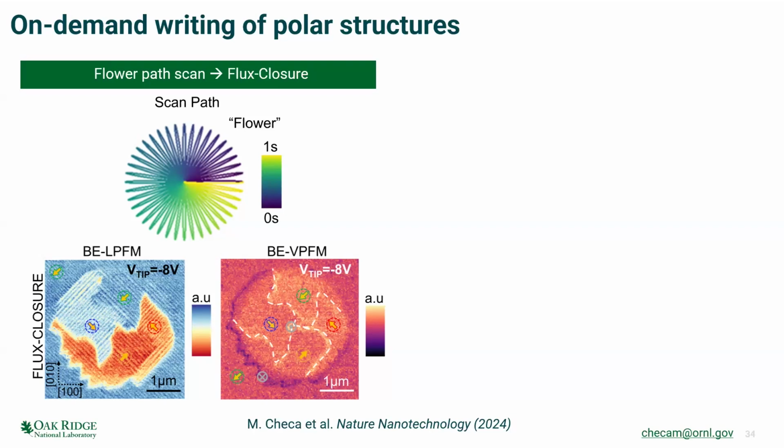Then the key point here is the expertise on controlling the FPGA, and we have a LabVIEW software that is kind of our holy Bible, where we control with Python, and that's what allows us to do all this. We've done it with the Cyphers, with the NanoSurf. As long as you have access to your controller, it's not AFM limited. We've done it with the Brukers too. It's more about having the expertise of controlling the FPGA and giving the inputs to the AFM controller, if that makes sense.